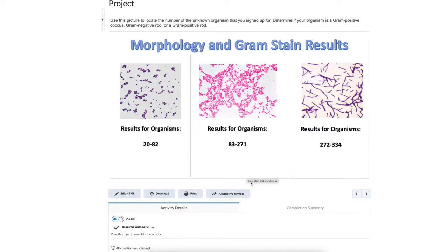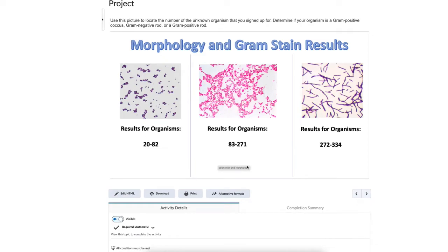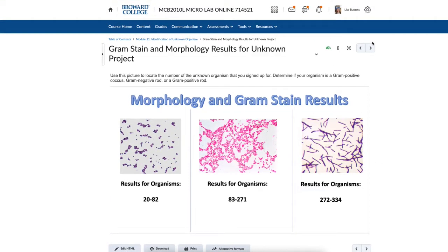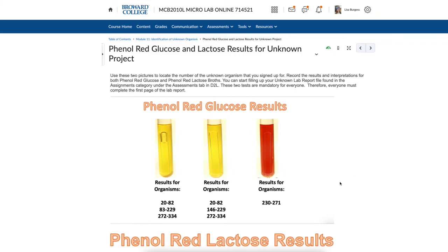The gram stain results become accessible after you complete your unknown project survey — there's a condition set on that sub-module. Opening it up, you can see three different pictures. You should know how to read each image: which is gram positive, which is gram negative, which is a rod, and which is a cocci. For example, if you selected unknown organism 65 — which falls between 20 and 82 — the first picture is your result. If you selected 105 — between 83 and 271 — the second picture is your result.